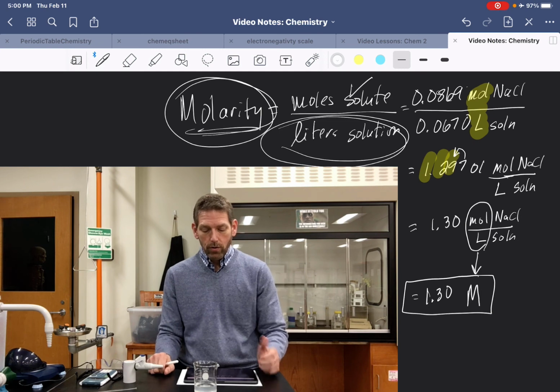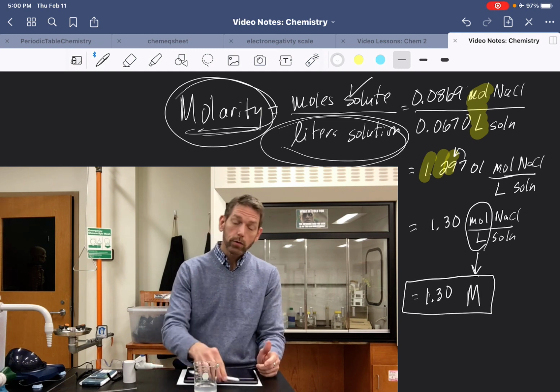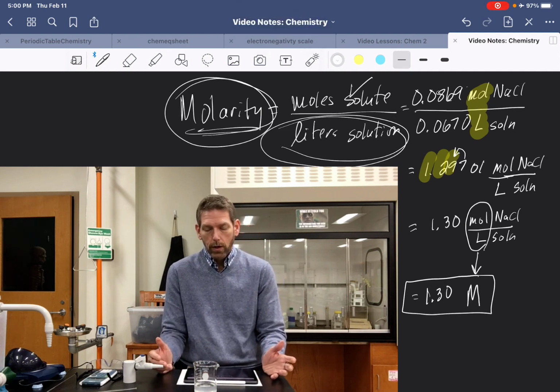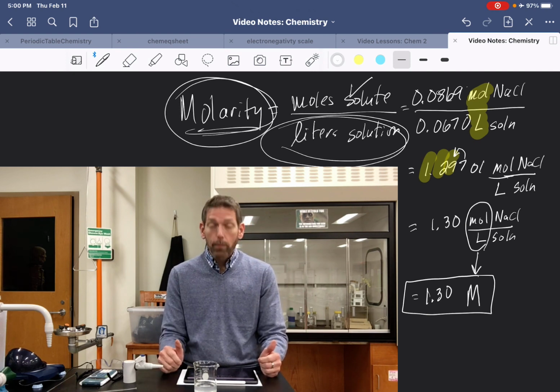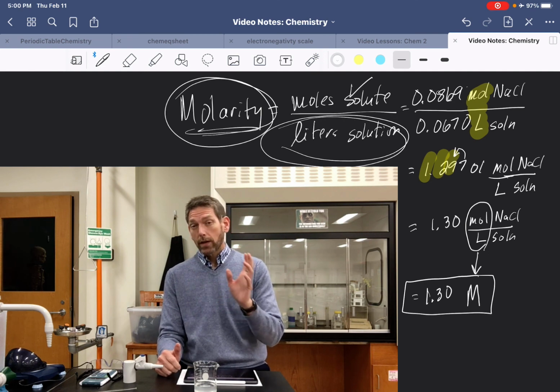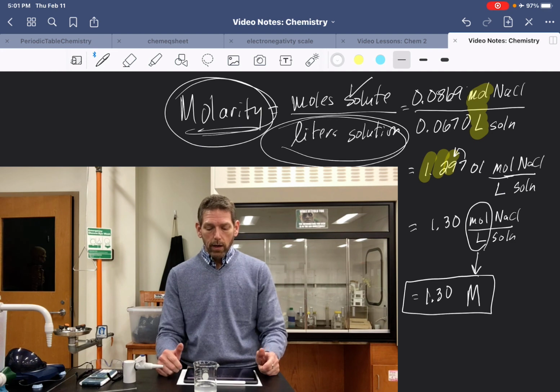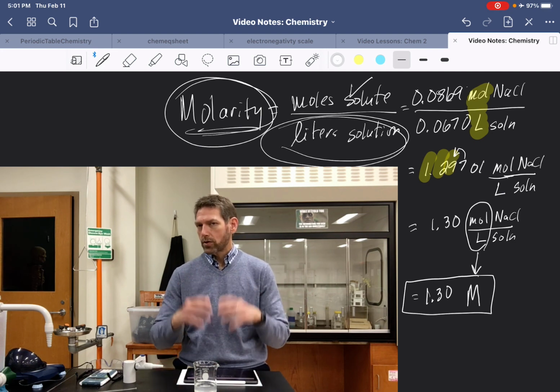All right. So there's the basics for molarity. And this works with anything. I don't care what your solvent is. This is a basic way to measure out molarity. There is another video that I'm going to make upon request that explains a lot more about dilutions, but I'll make that a completely separate video because I have other lessons where we incorporate this, and in those lessons, it's assumed that you understand this.